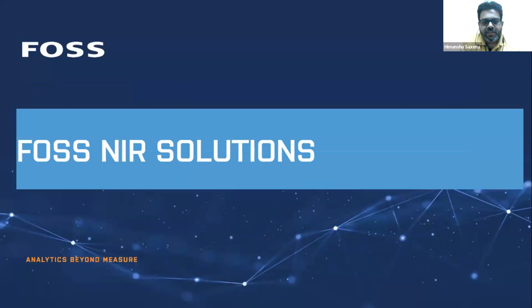So we heard Professor Chung talking about the deep insights of the calibration techniques and the modeling, the PLS, the ANN, and all those things. What I would focus upon is more from a layman user perspective, because NIR is both a very complex and a very enthusiastic thing. One is what is the scope of NIR theoretically, and second is what is more commercially and industrially feasible. As an NIR instrument manufacturer, we focus on applications that are more feasible, wherein we can create robust models and which can be adapted on an industrial scale.